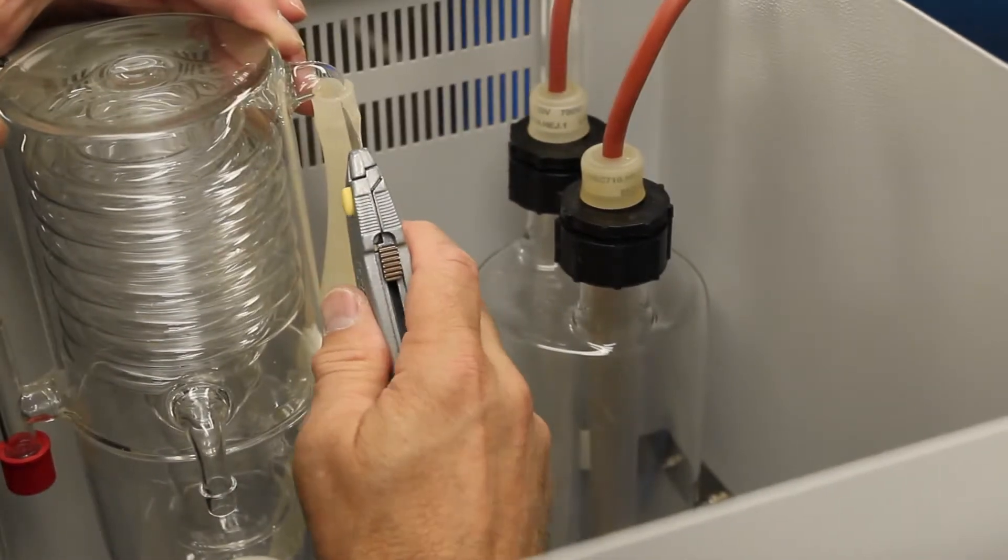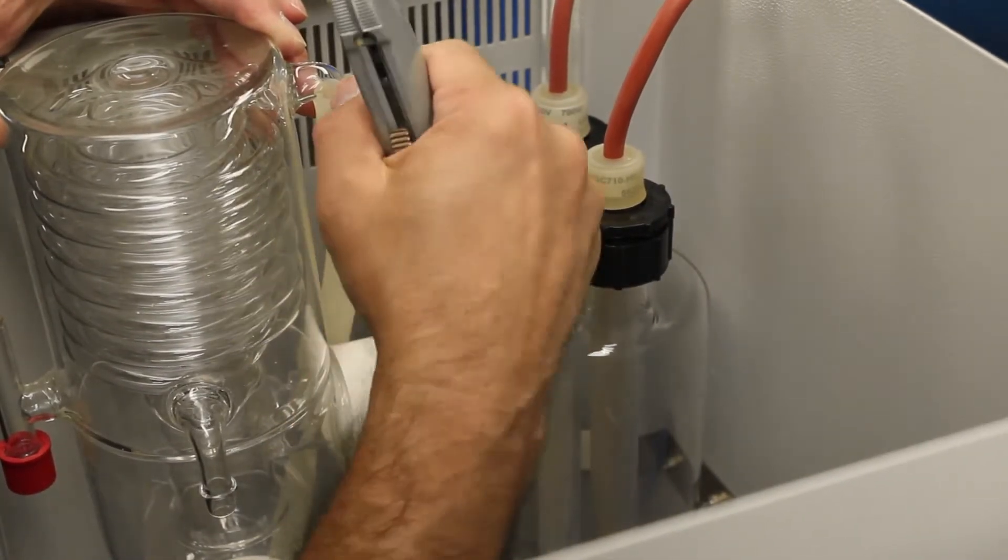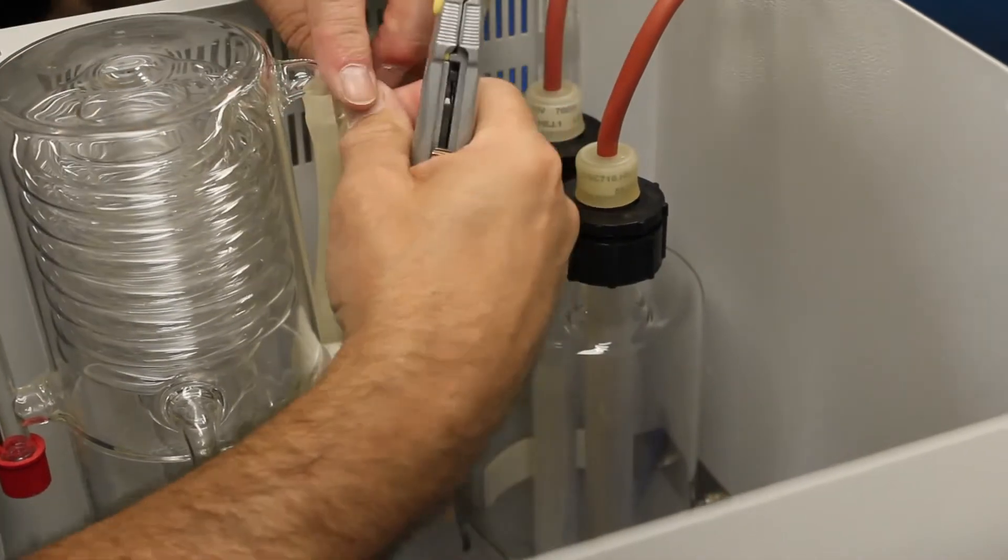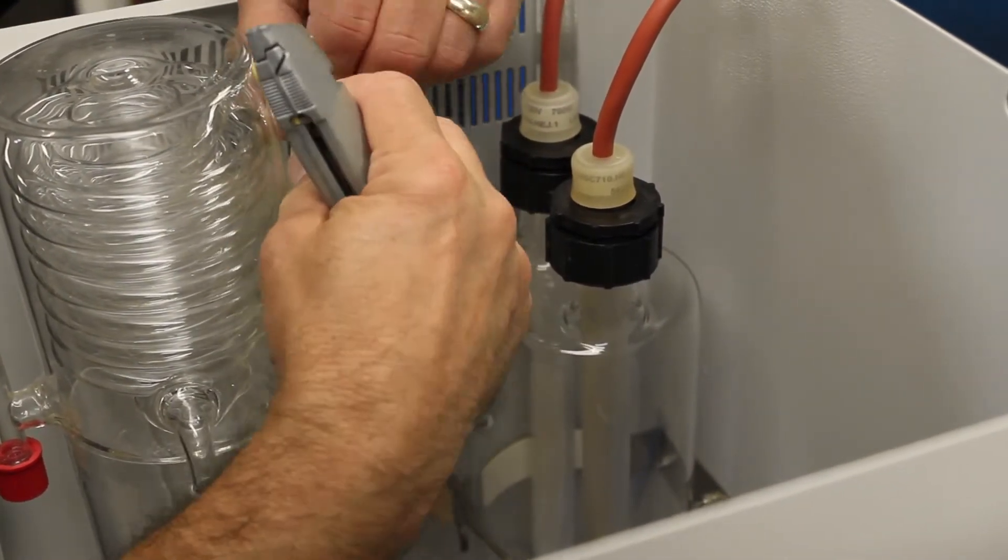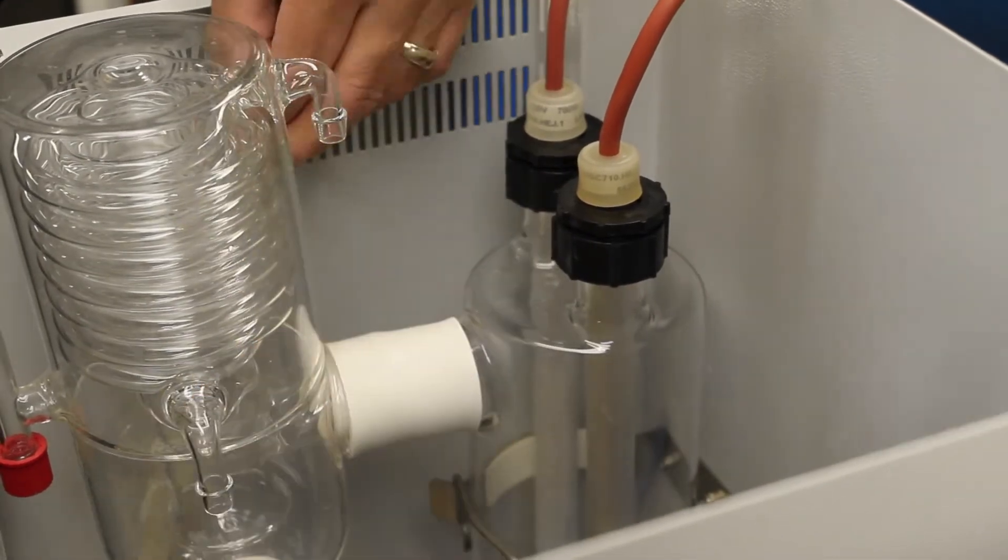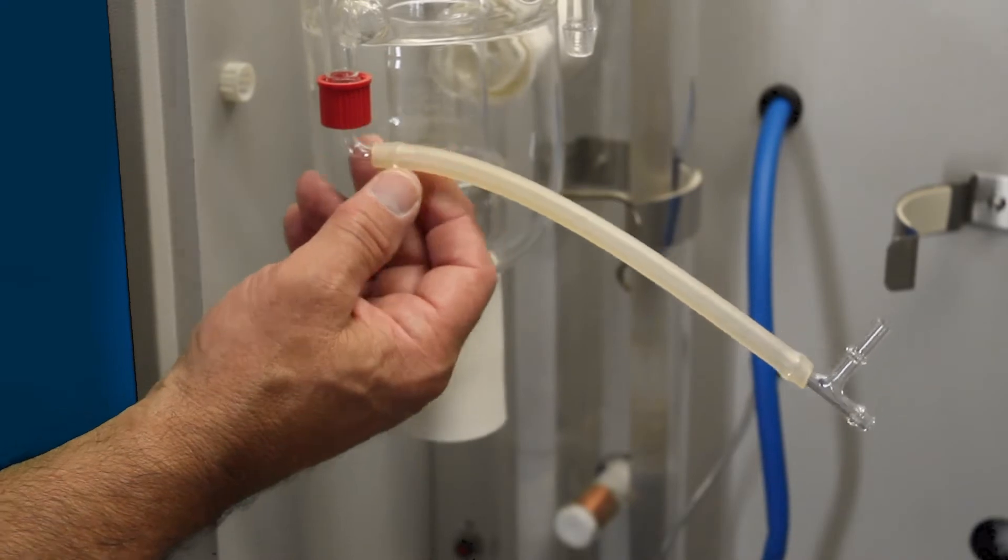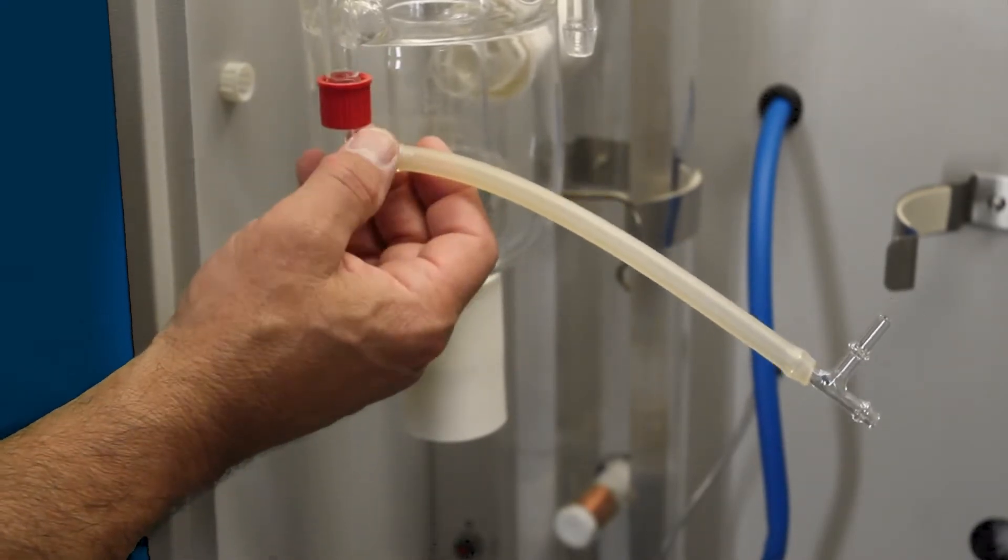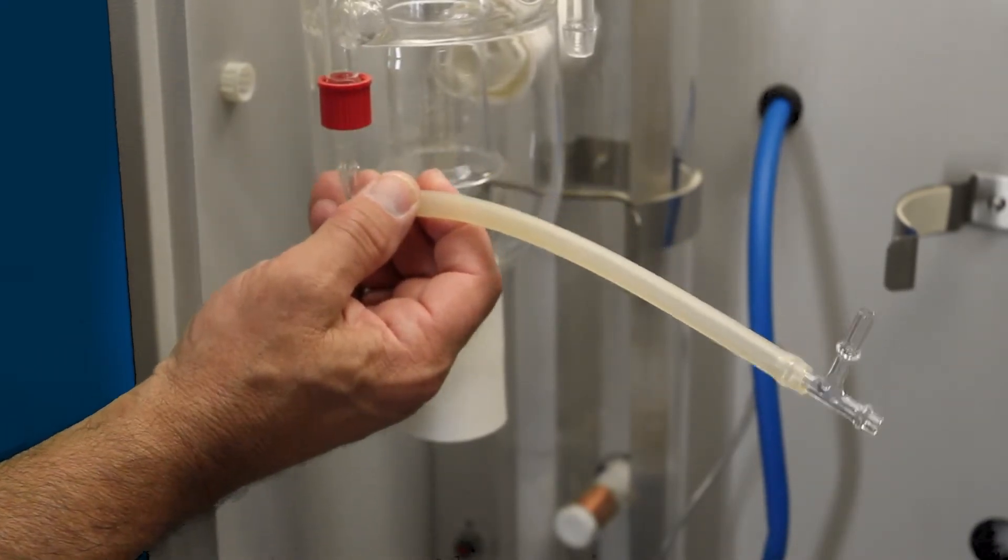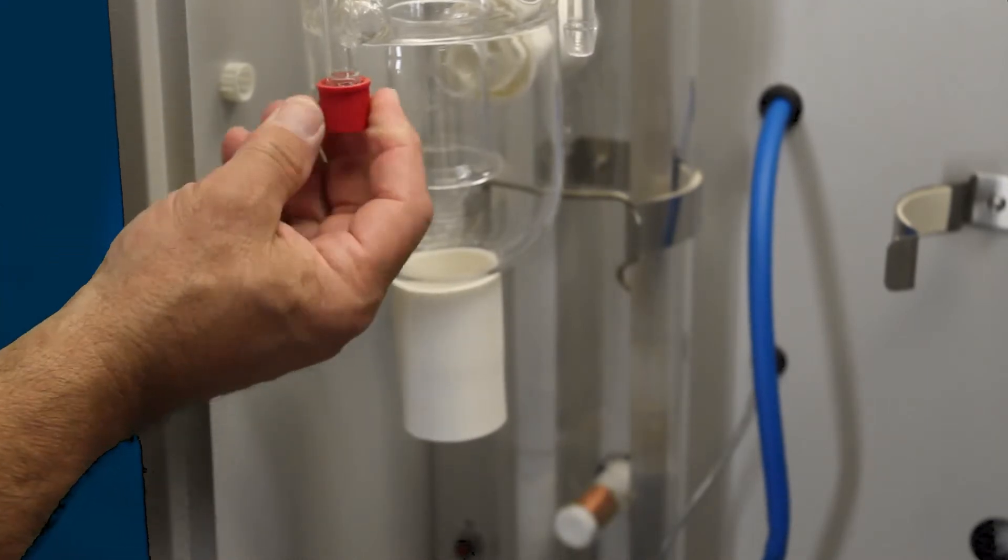And simply slice straight down, peel the tubing around, and that'll pull the tube right off. The next item we're going to remove is the distillate elbow. This is where distillate water comes out. Slide that down. Remove the red cap.